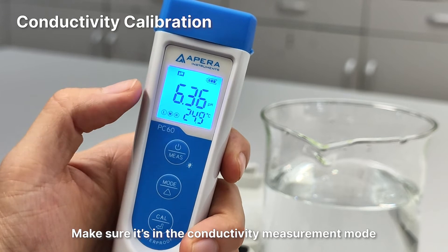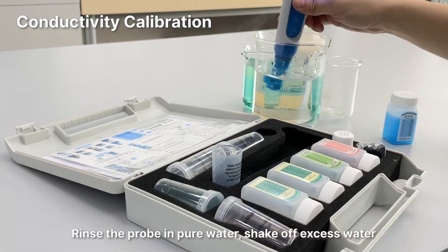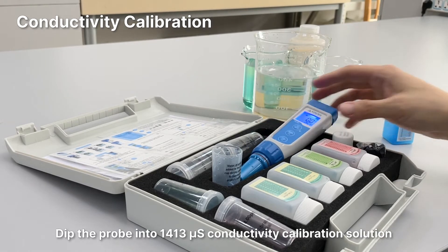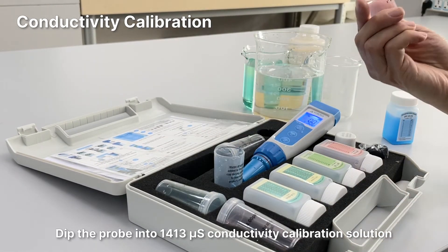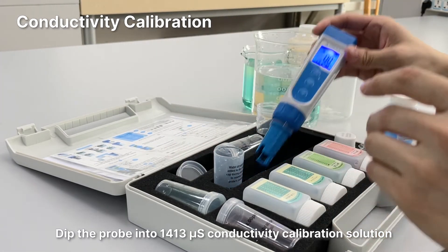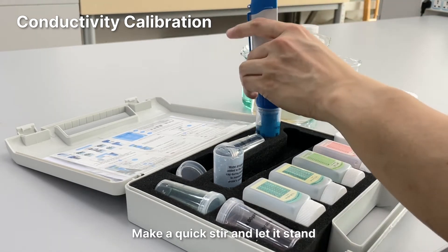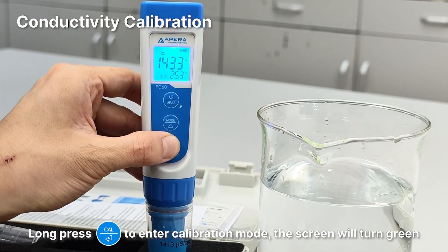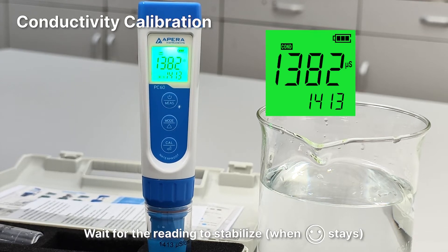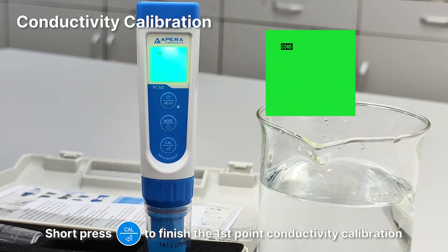Conductivity calibration: Make sure it's in the conductivity measurement mode. If not, press the mode button to switch to it. Rinse the probe in pure water and shake off excess water. Dip the probe into the 1413 microsiemens conductivity calibration solution. Make a quick stir and let it stand. Long press the cal button to enter calibration mode — the screen will turn green. Wait for the reading to stabilize. When the smiley face stays on, short press the cal button to finish the first point conductivity calibration.